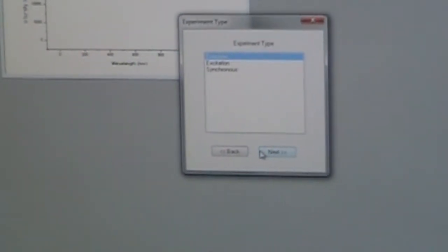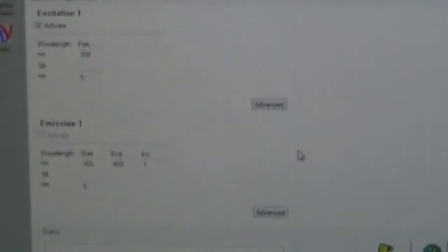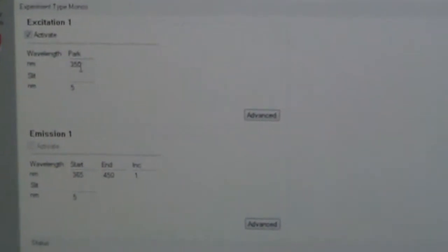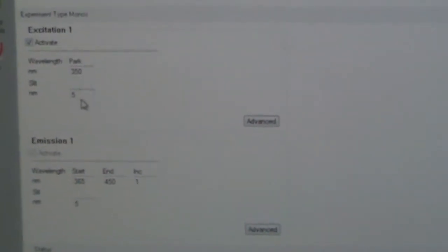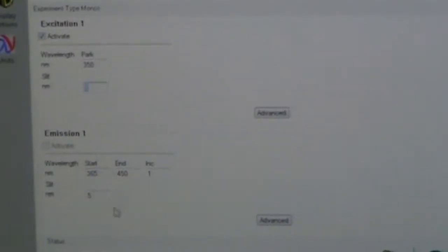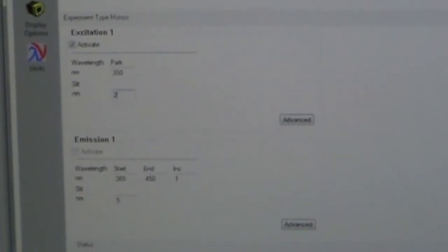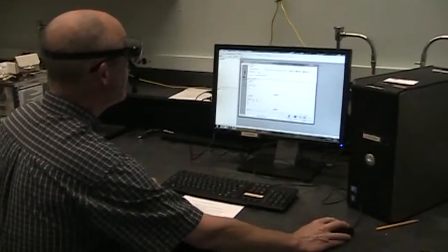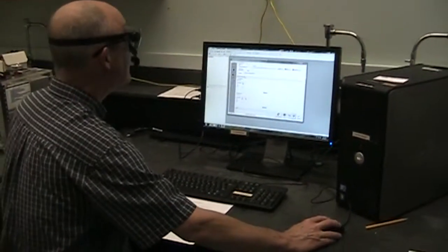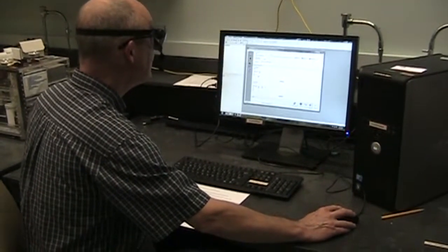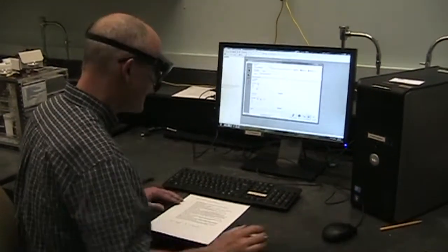And then this is where we can set up the conditions for our measurement. Pick the excitation wavelength and set up the emission wavelength. Again on this experimental setup we've picked the emission experiment.